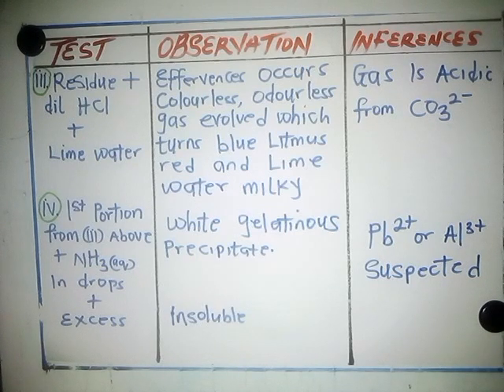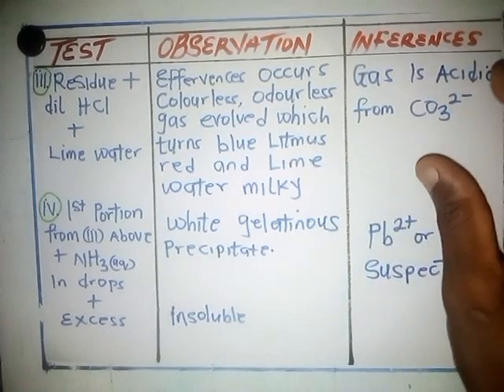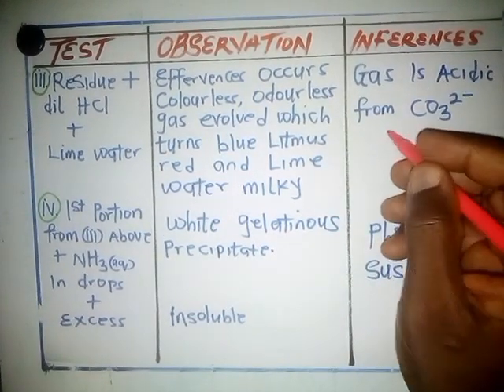That is carbon dioxide. I think there's a mistake here. Normally I'm supposed to say gas is CO2 from, I'm just going to put it here.